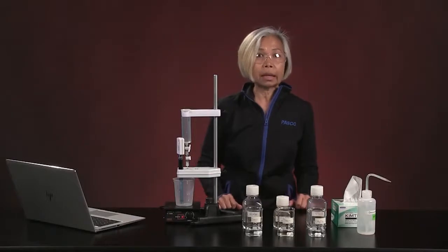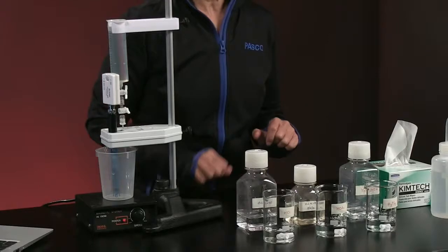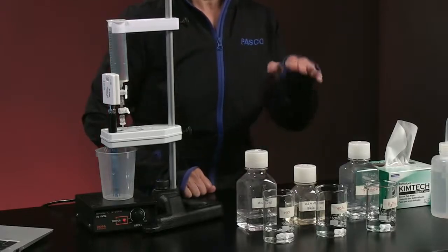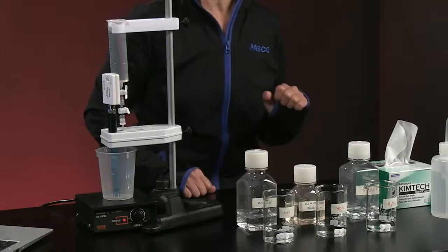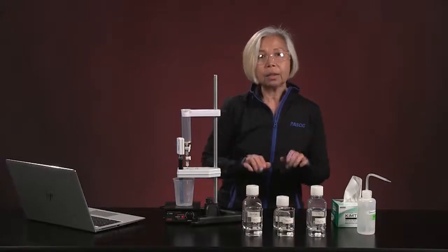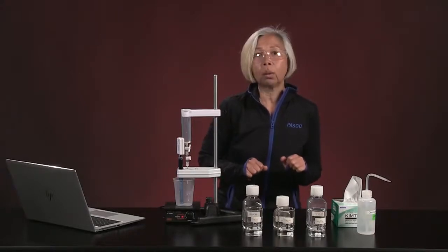Let's talk about the acids that we're going to be examining today. We have a sample of hydrochloric acid, a sample of a weak acid, acetic acid, and a polyprotic acid, phosphoric acid. Now, each of these acids has a concentration of approximately 0.1 molar.